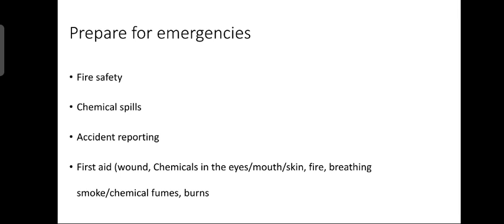Flush eyes or skin with water at least 15 to 30 minutes. Use soap for intermediate and final cleaning of skin areas. Then protect yourself and remove injured person to fresh air if safe to do so.